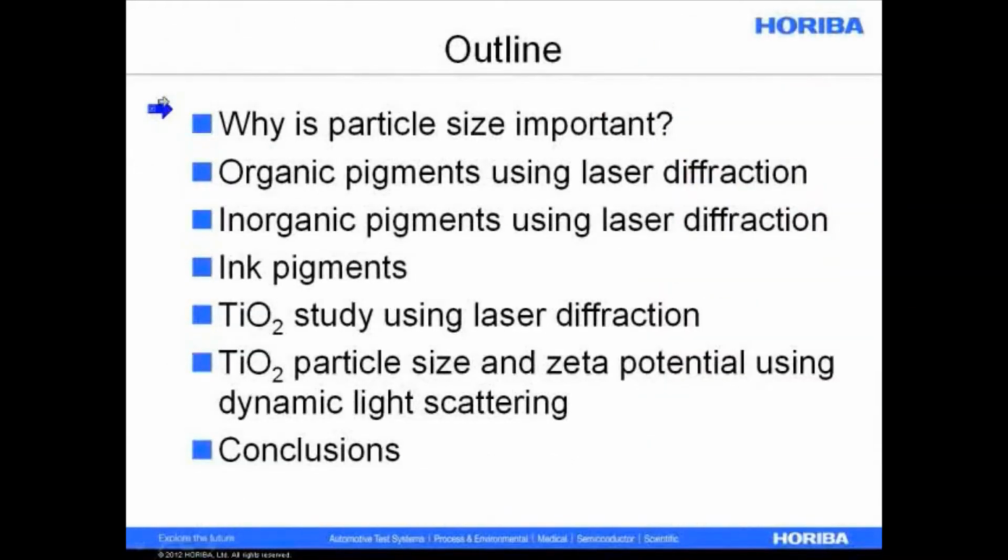Perhaps why is particle size important to these kinds of samples. I did a study a few years ago of organic pigments using the LA950 laser diffraction analyzer. I'll show you that data. Some data we've collected through the years for inorganic pigments, something about inks.